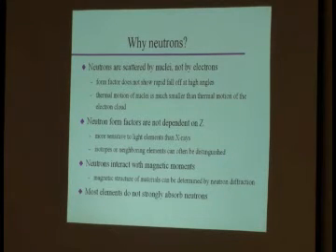Another reason why people do neutron diffraction is neutrons actually interact with magnetic moments. So you can determine the magnetic structure of your material using neutron diffraction. That is actually one of the very big reasons why people use neutron sources.